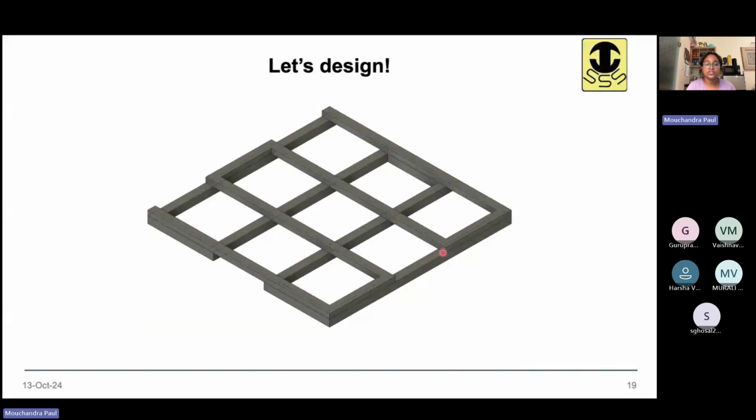So it's a 3D lattice structure, and these kinds of designs are very common for tissue engineering applications, because you see there are some big size pores, and if you bioprint it using a bioink with cells present inside these filaments, and when you dip it within a vat of cell culture medium, then the diffusion rate becomes much faster. So for tissue engineering applications, these kinds of lattice structures are very common and widely used.